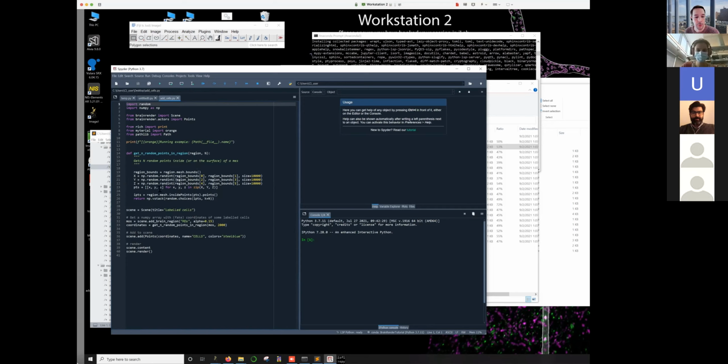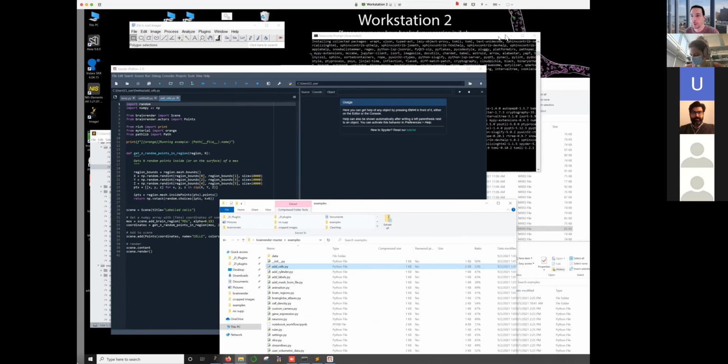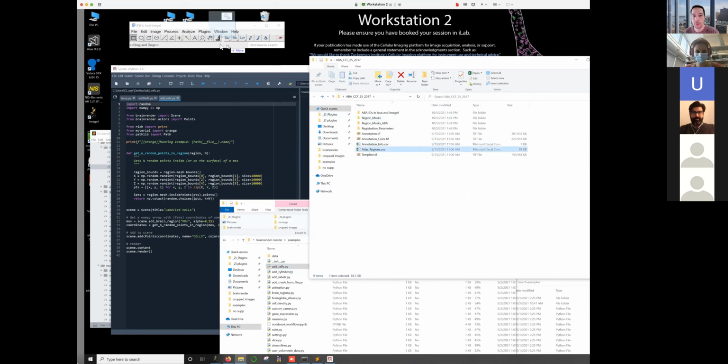If you look just a little bit further down, it's saying make the coordinates using this function up here called get random points in this brain region. And they've defined that brain region just here. The nice thing about BrainRender is it uses the abbreviated region title. If you're not sure what brain region we're talking about, or you've got a brain region, everyone will have their brain regions that they're working with a lot, you can always look those up in the Atlas CSV file.